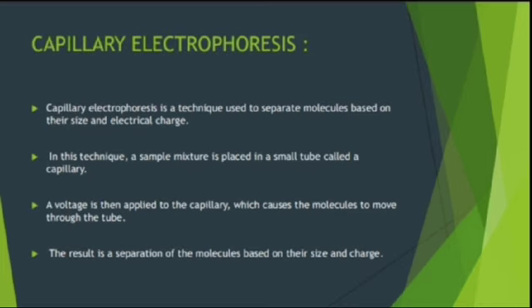Next, capillary electrophoresis. Capillary electrophoresis is a technique used to separate molecules based on their size and electrical charge. In this technique, a sample mixture is placed in a small tube called a capillary. A voltage is then applied to the capillary, which causes the molecules to move through the tube. The result is the separation of molecules based on their size and charge.